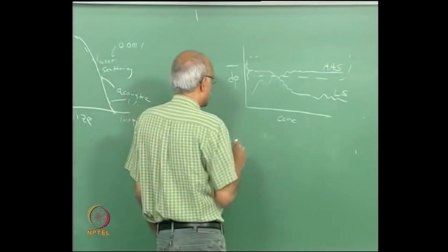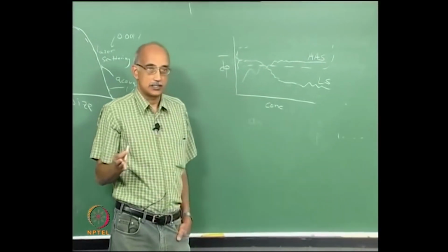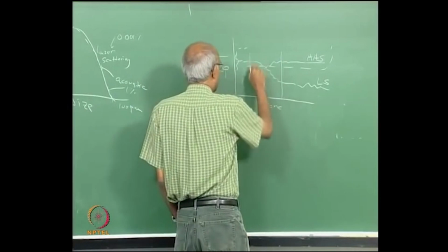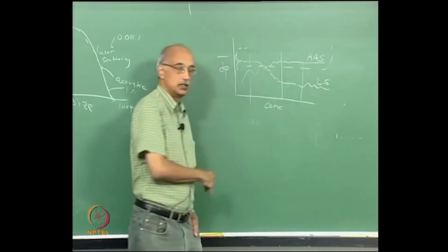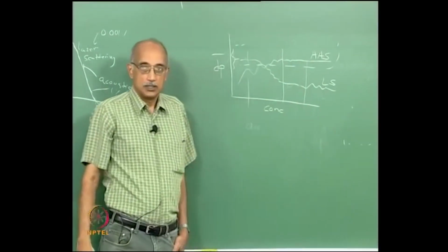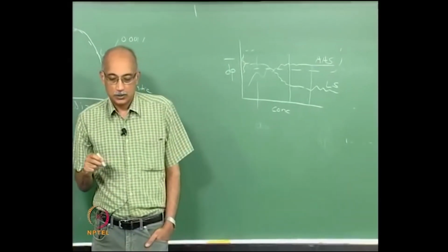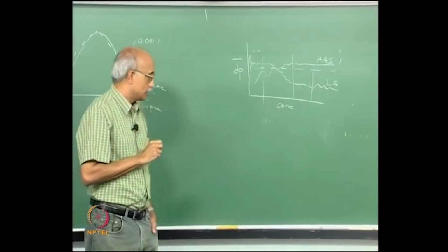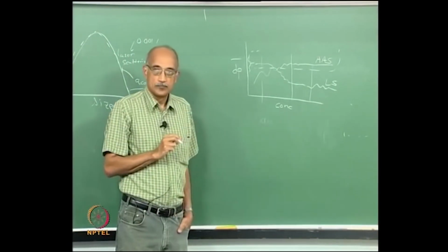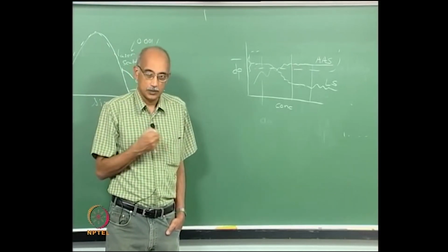Depending on the concentration, if you use the same concentration, then it is very unlikely that you will get the same data. In fact, there will be for the most part a significant deviation. Coincidentally, there may be a point where they coincide, but even that would not be the correct value, because this value is obviously not the right value. The asymptotic value that you see is the actual mean size, and that is why it is very important to understand the principles involved in various measurement technologies and make sure that we use the one that is appropriate for our sample.